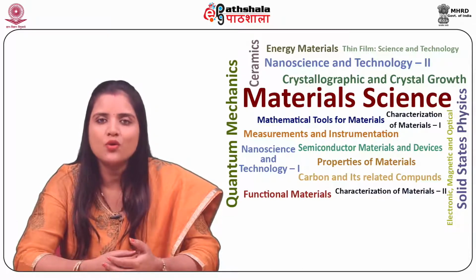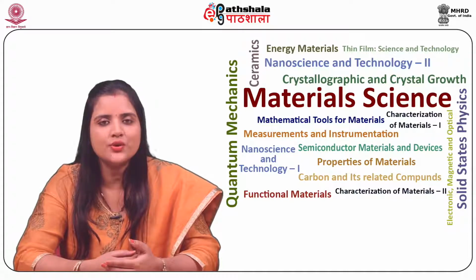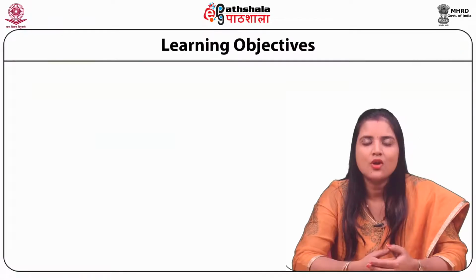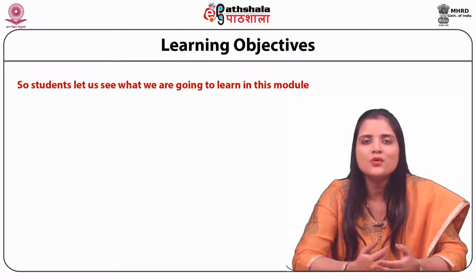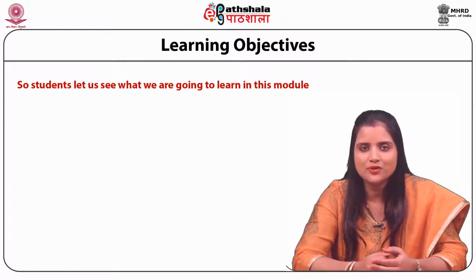Today we are going to talk on the module Energy Dispersive Analysis of X-rays, that is EDAX, under the paper Characterization of Materials 1. So students, let us see what we are going to learn in this module.